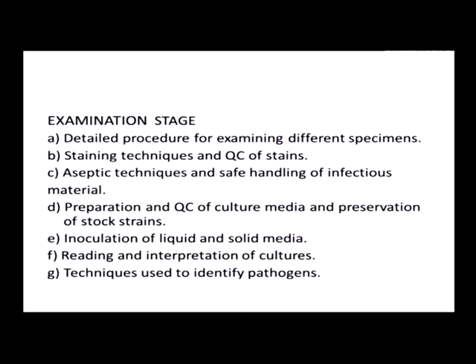Now this becomes very essential, because in a hospital where you will have to maintain these strains, this will definitely be important, and you have to again keep the temperature requirements, because it may be at a lower temperature, higher temperature. So that needs to be kept in mind. Then inoculation of the solid as well as the liquid media. Definitely, we need to keep that in mind.